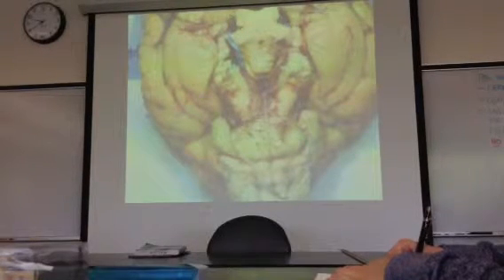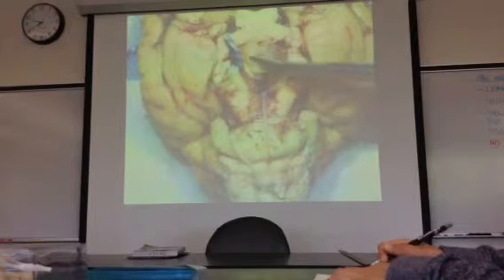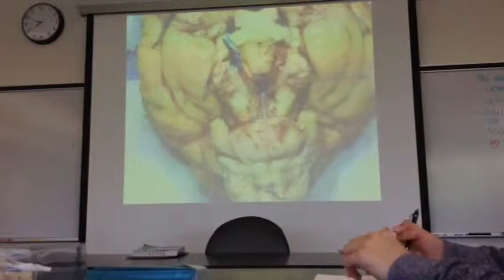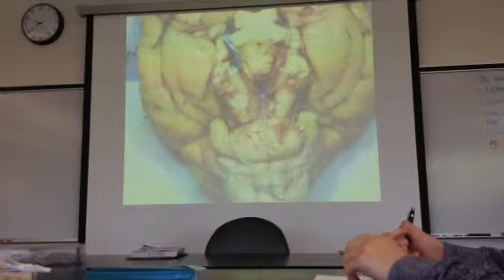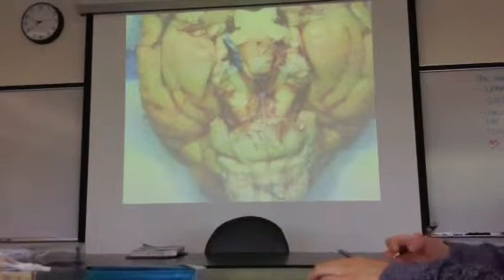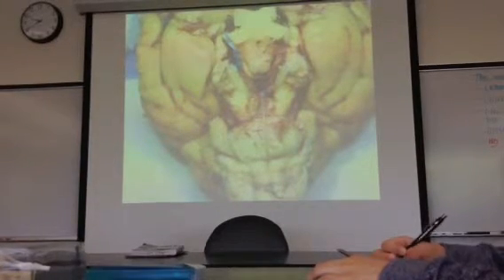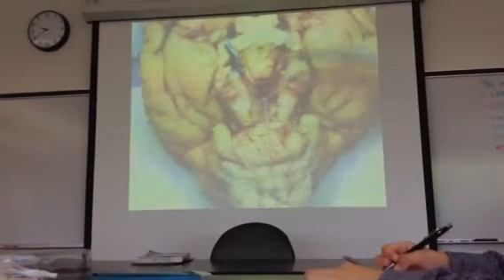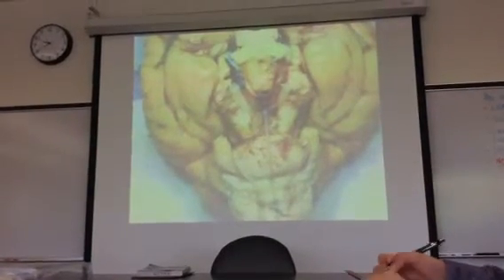Once in a while, you'll find a set of mammillary bodies that, instead of looking quite fused as a singular structure, has a little bit of cleavage between it, okay? I guess that's what he saw the first time, was the one that looked more cleaved. Whatever. All right. So that's that hole where I pulled out the stalk that holds the pituitary in place.